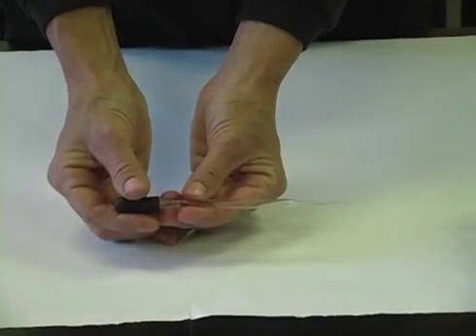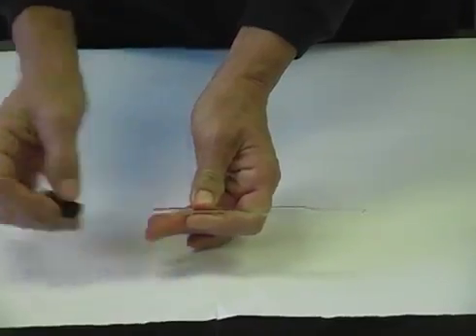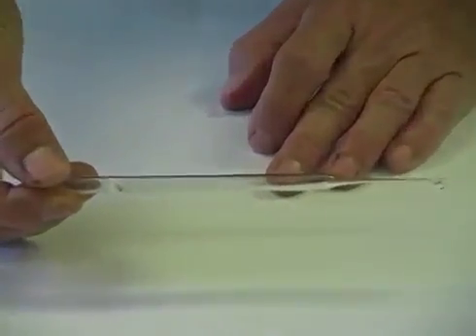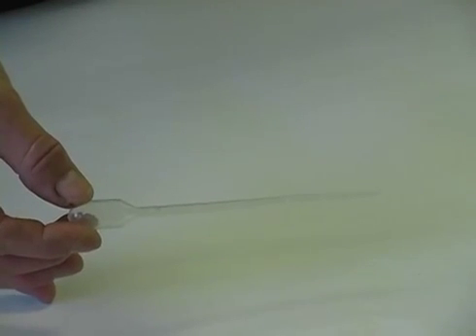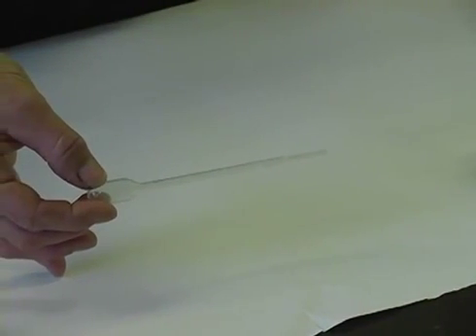When we finish using Pasteur pipettes, we need to remove the rubber bulbs as they're not disposable. Very, very important that the Pasteur pipettes go into the sharps or broken glass container, never into the regular trash can. Plastic transfer pipettes may also be used. Normally, if they're used to transfer microbial cultures, after use they're placed into an autoclave or biohazard bin to be autoclaved.